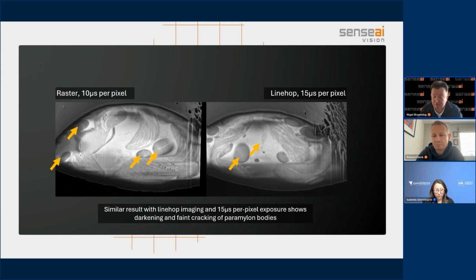In cases where we haven't had to worry so much about getting back to the original resolution precisely, for example, we've done some things on some NASA data sets from satellites. In those cases, we can get down to about 0.5% subsampling and still reconstruct the image with the accuracy needed to solve the problem. And for microscopy, what that would be is to say that, if you don't want the 1 nanometer or 1 angstrom resolution of the microscope, and you can maybe go to 2 nanometers or 2 angstroms, then you can do more subsampling to go into that process. So the numbers we pick are usually the ones at the moment that we know will give us the best reconstruction for the least amount of effort.